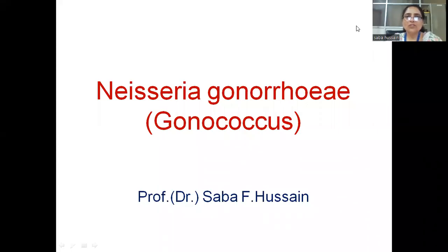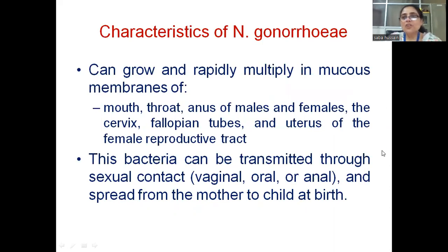Hello everyone. Today we will be discussing Neisseria gonorrhea, which is also commonly called gonococcus. Going to the next slide, we are going to study the characteristics of Neisseria gonorrhea.